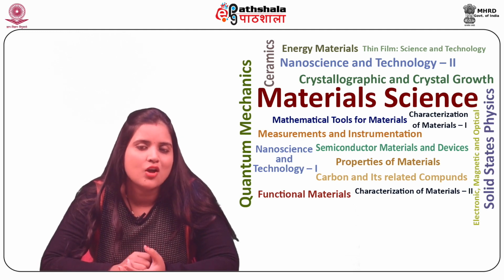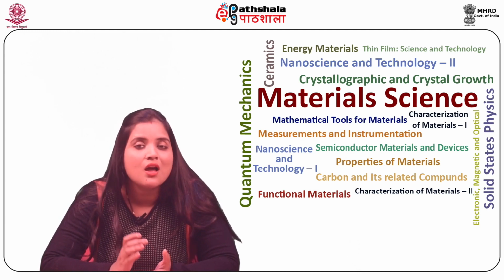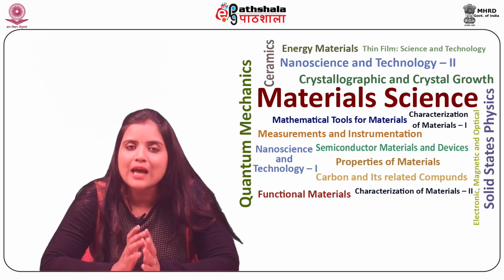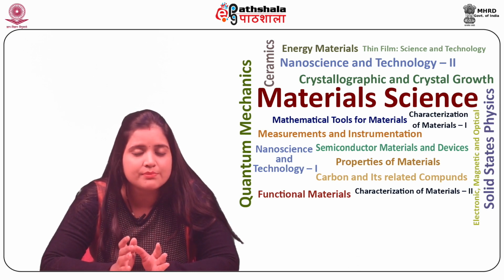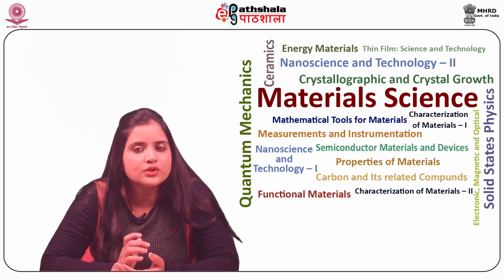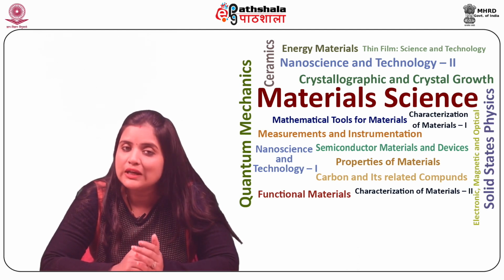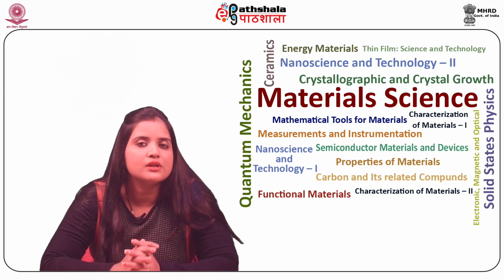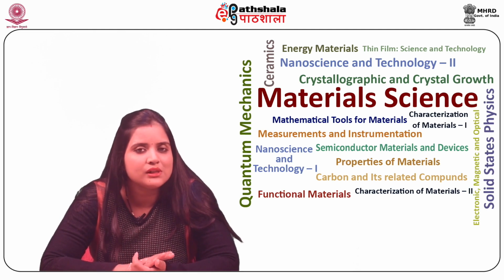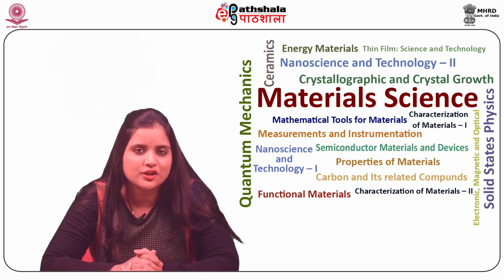We will now discuss the advantages of the STM. STMs provide a three-dimensional profile of the surface, which allows examining multiple characteristics of the sample such as roughness, surface defects, etc. It also allows measurement of various properties of the samples such as electrical, mechanical, optical, etc. STMs are versatile and are operable under ultra-high vacuum or ambient conditions.